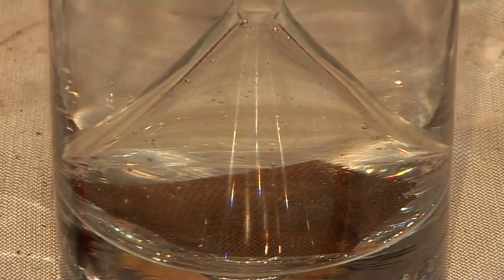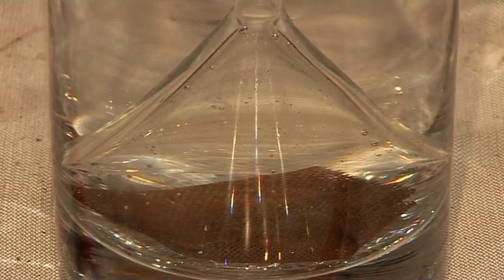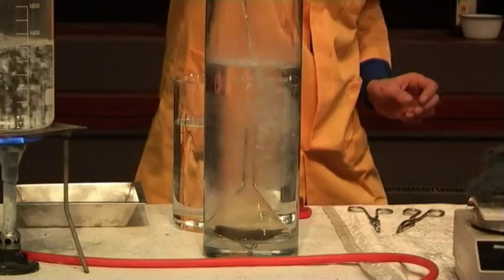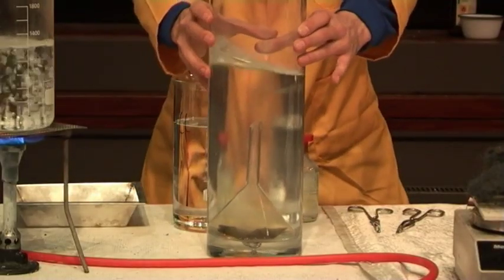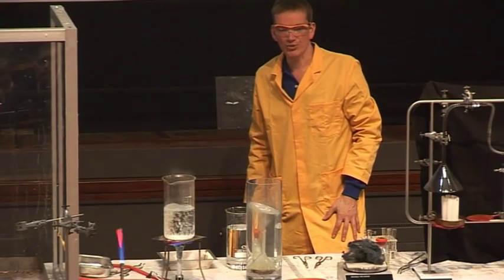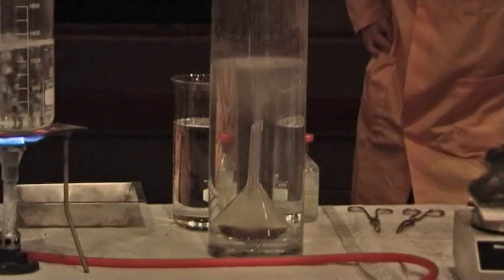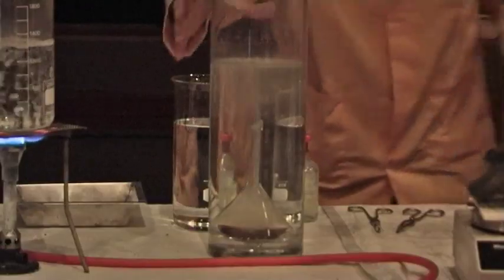In the bottom we have a funnel with a compound called magnesium silicide, and as soon as it comes into contact with acid, we get a gas called silane, SiH4. And any second now we should see some bubbles forming. And the bubbles, when they come into contact with the air, I hope, should catch fire, all by themselves. That's it.